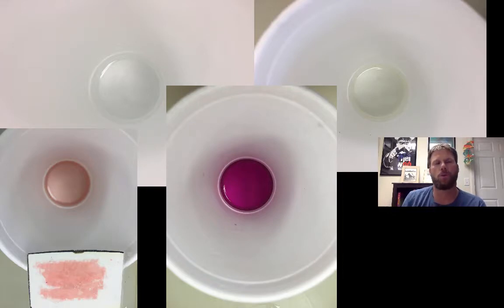Now it's time for you to go practice your titration. When you think you have the right color, perform the calculations and check to see if you are in the appropriate range.